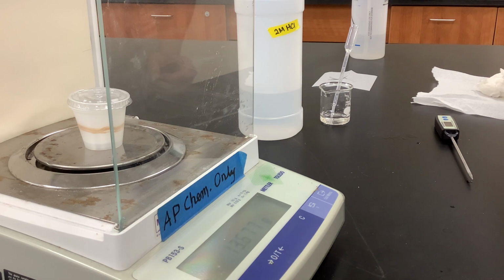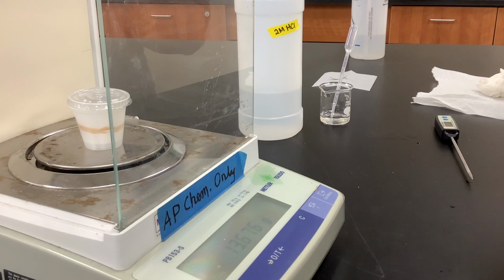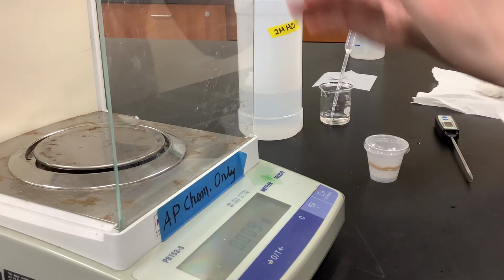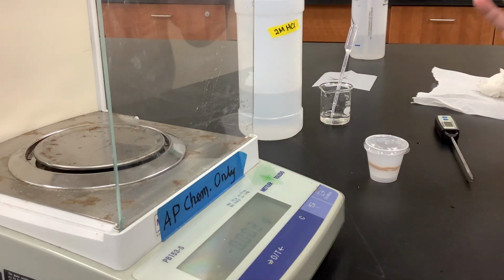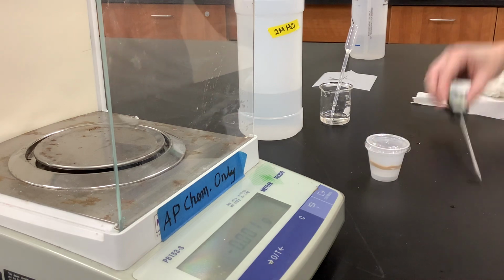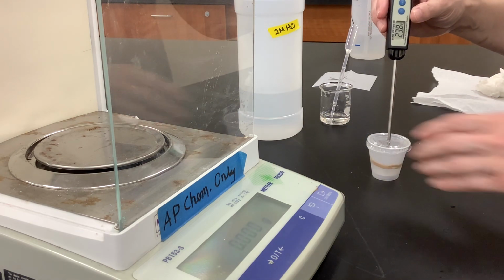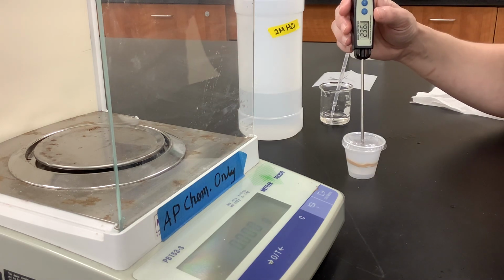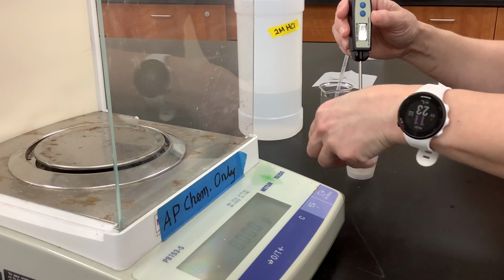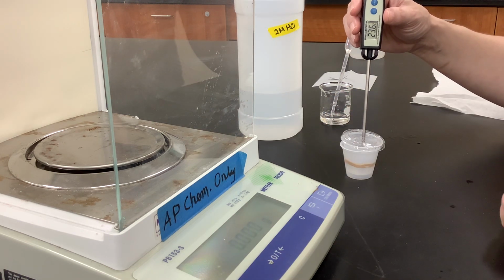Okay, so it looks like 13.677 it looks like. Okay, just so you know, this is a pretty sensitive scale, so even just air passing by can make adjustments, so you kind of have to be a little still. Okay, once again, we're going to take our temperature measurement here. Okay, our initial measurement of our solution. Okay, looks like about 23.6. Okay.